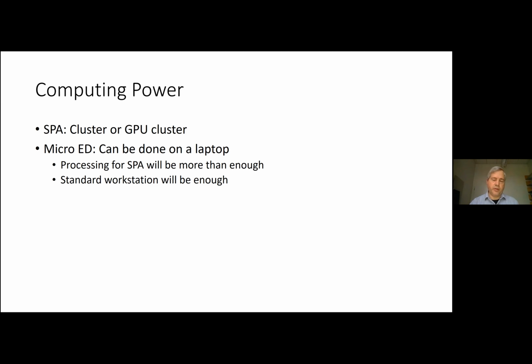And you could do all of the processing just on the laptop. So you don't really need too much processing power. If you have a computing setup which you were planning to do single particle or tomography on, that's more than enough for the calculations for MicroED. They're very similar to the X-ray crystallography calculations.